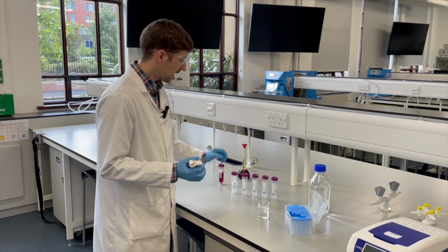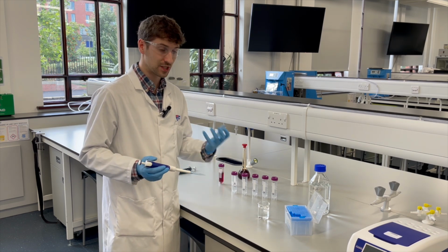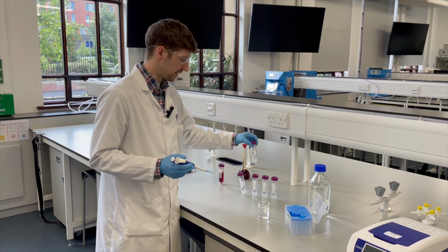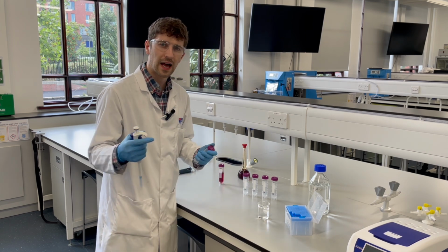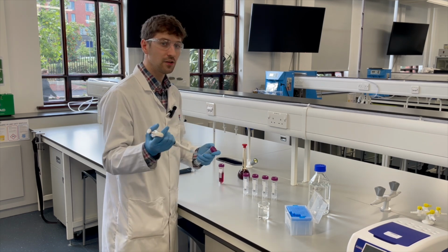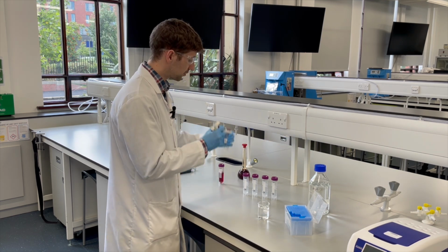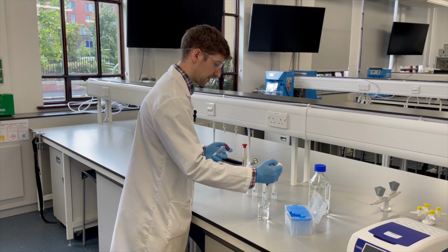My tip is, if you know what your end volume is or is going to be, to put the volume into each of these vessels first, okay? And this will make sense in a few moments, okay? So I know that I'm going to end up with 4 mils at the end, so I'm going to take my diluting agent and I'm going to put 4 mils of diluting agent in each of these vessels, okay?